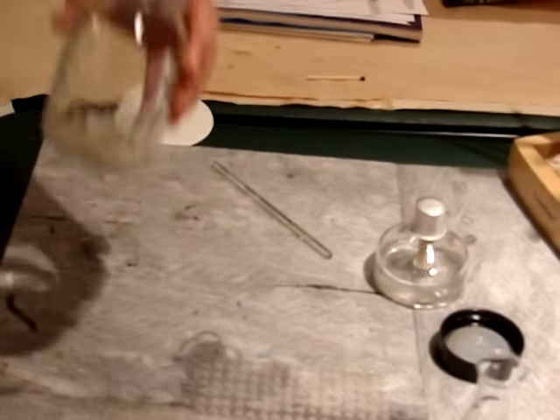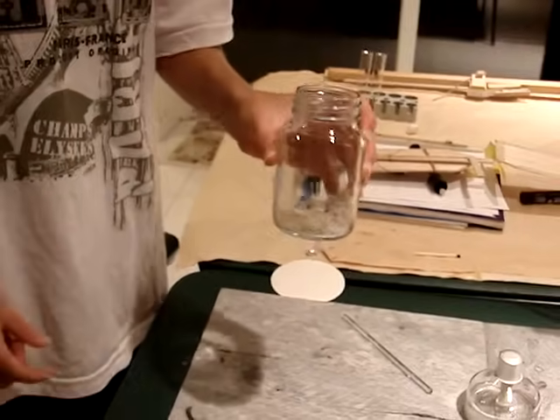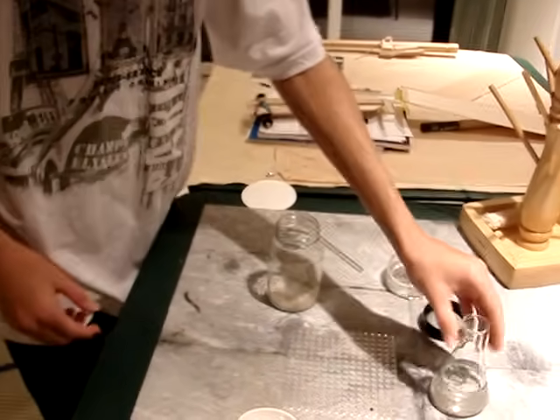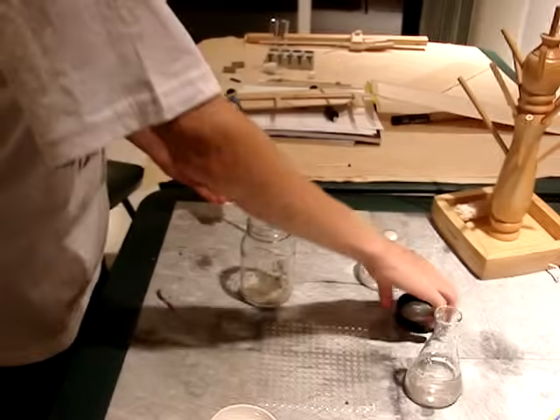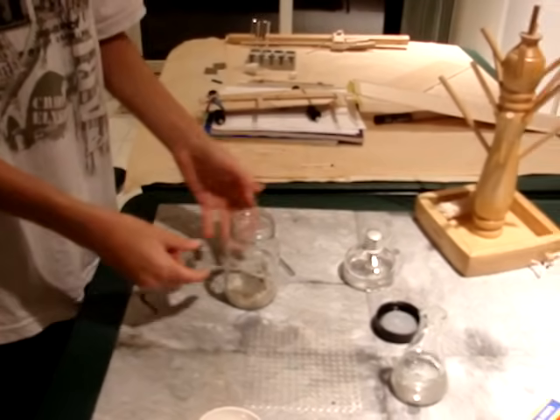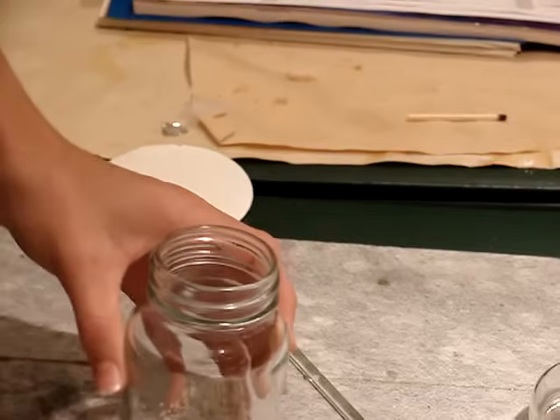Okay, so here I have a pretty nasty looking mixture of salt and sand, and what I'm going to do is separate it. The way I'm going to do this is I'm going to add water to it and use the stirring rod and shake it up until the salt is dissolved and the sand settles on the bottom. So I'll have salt water and some sand floating around.